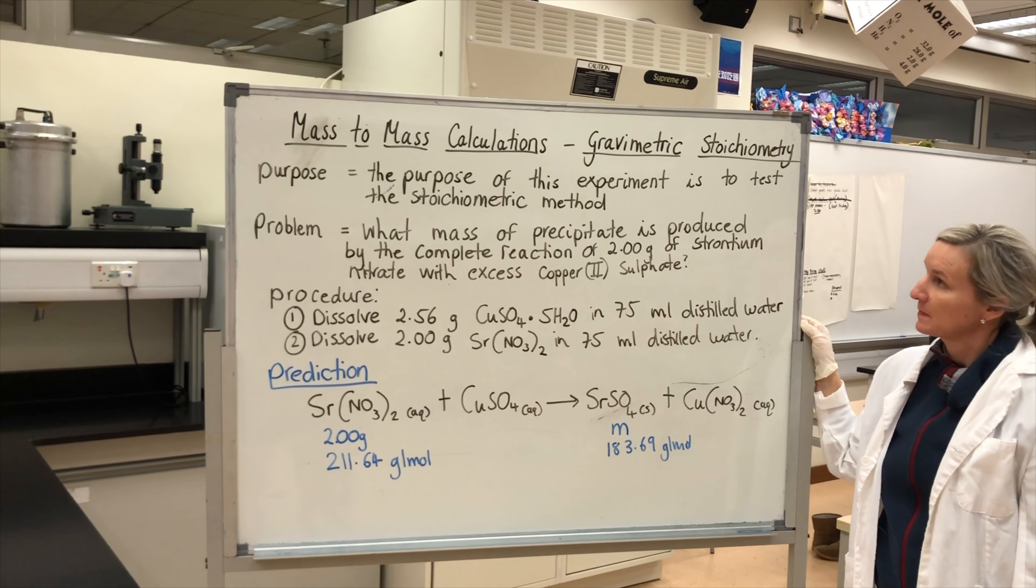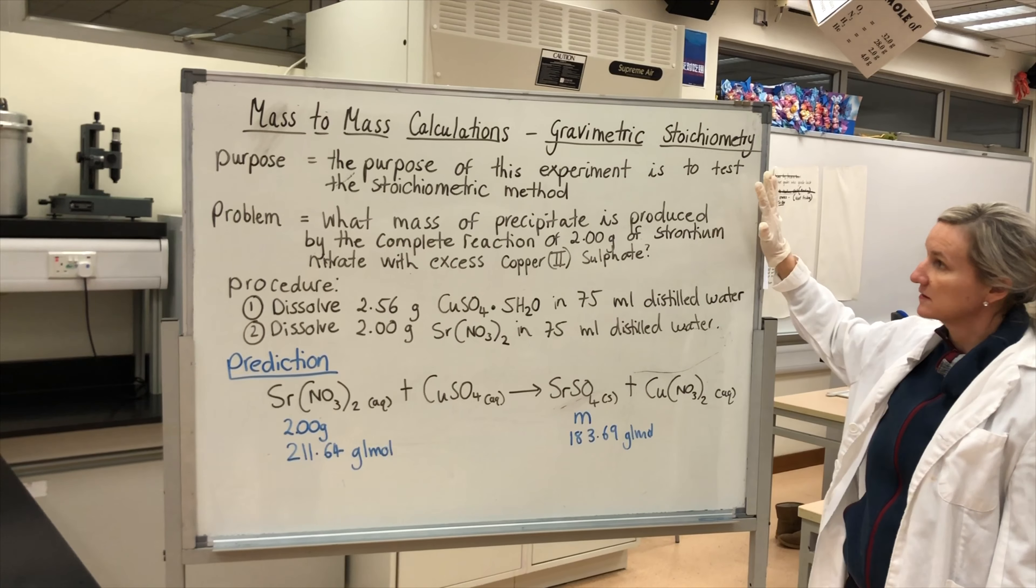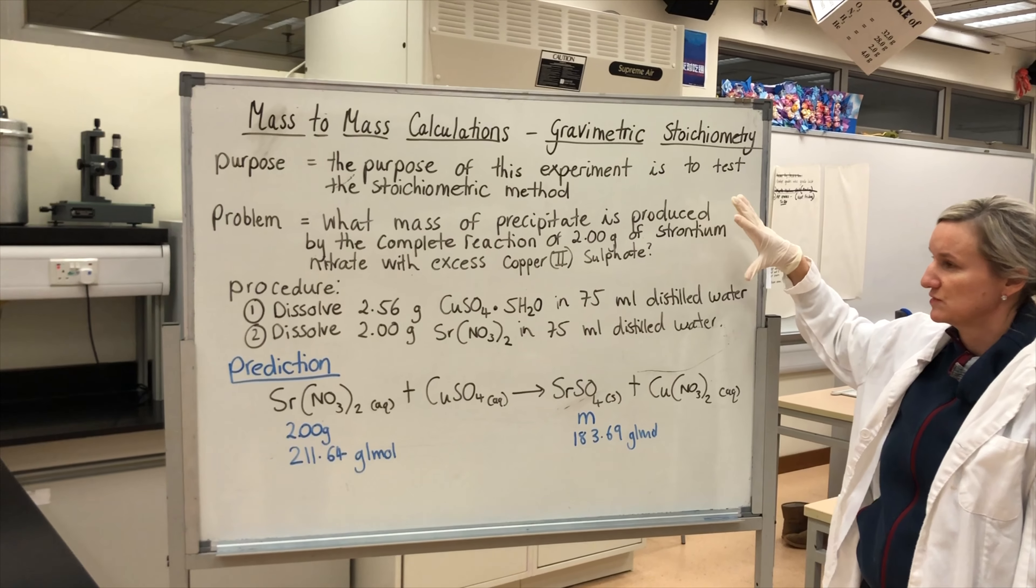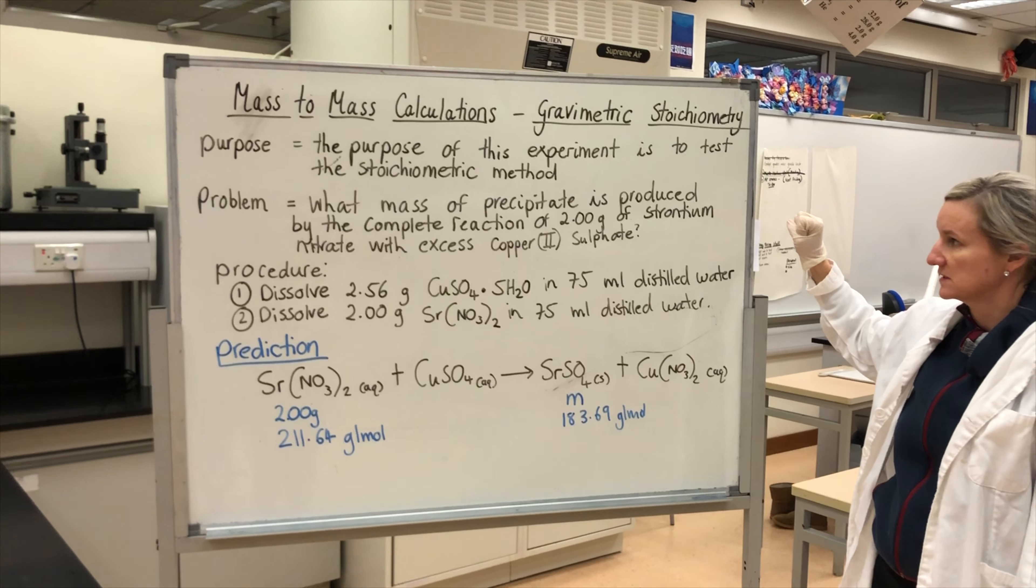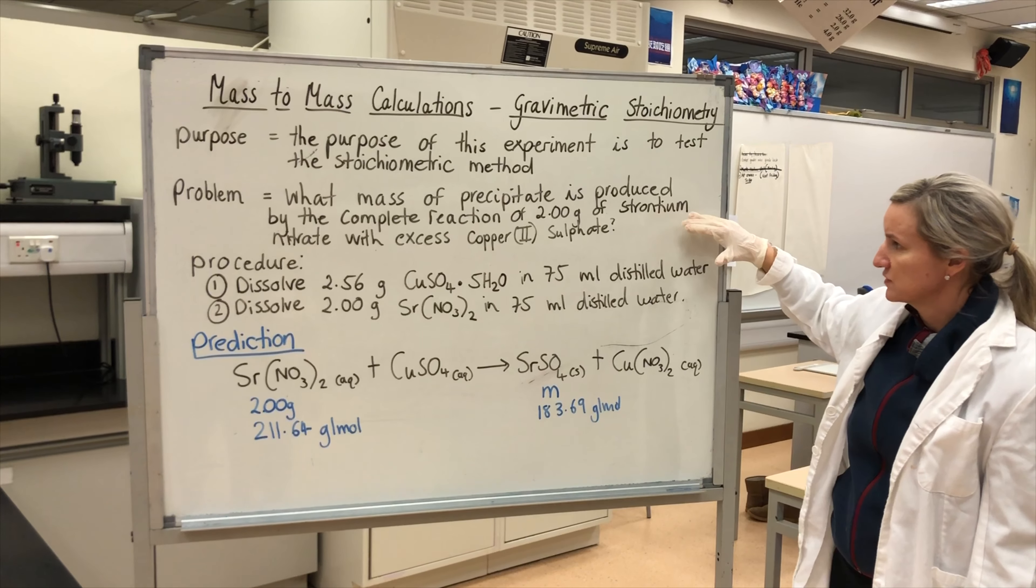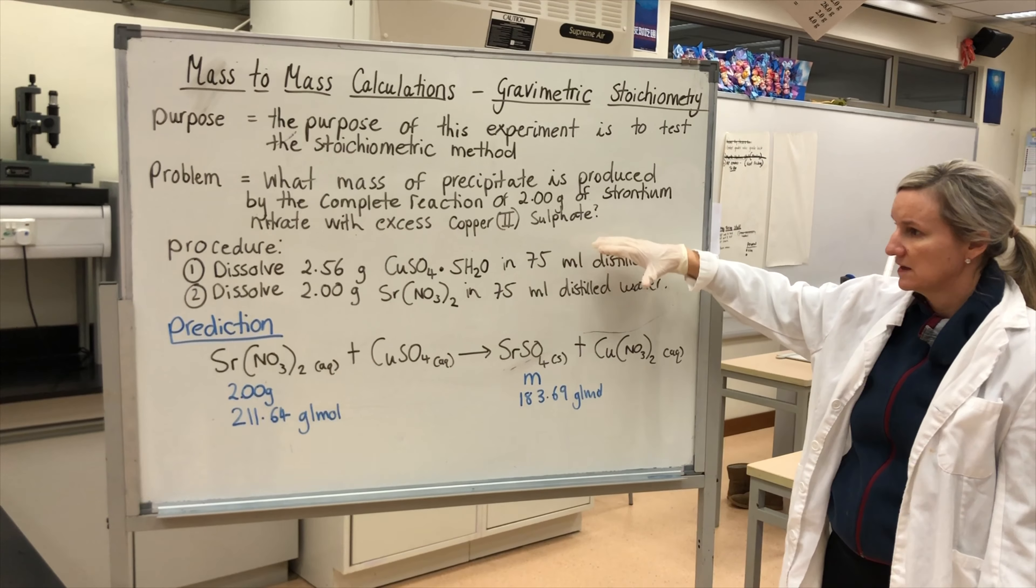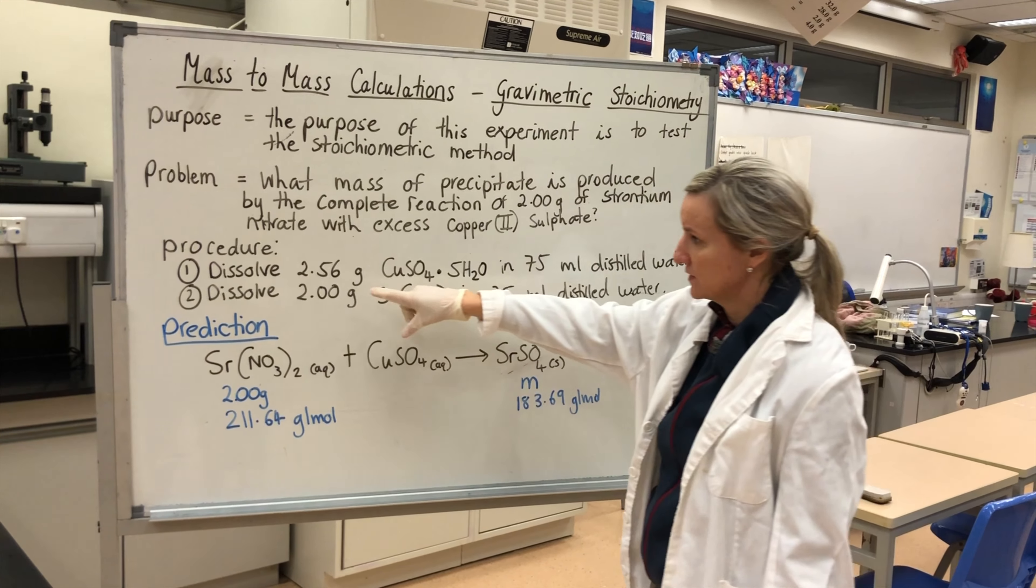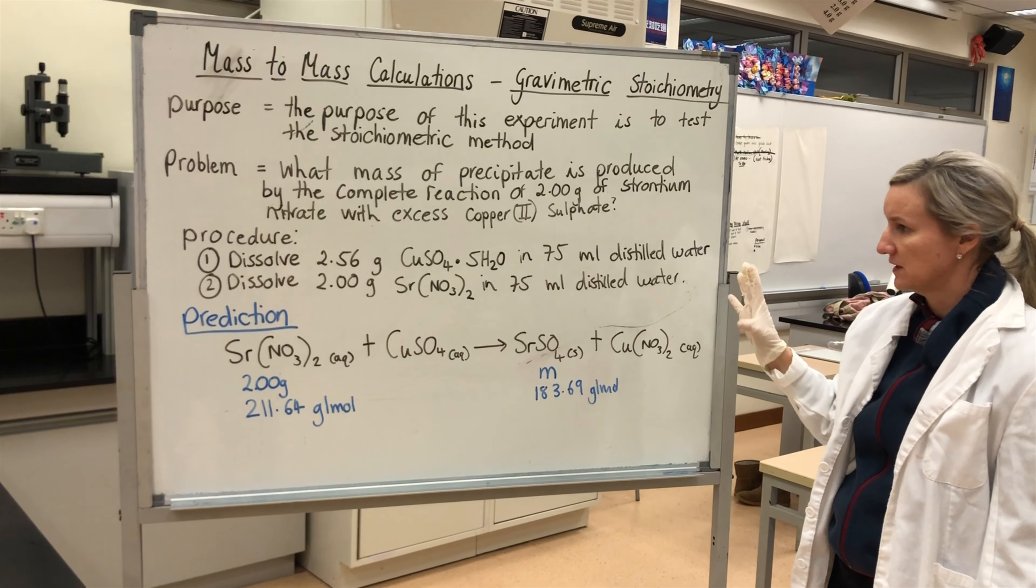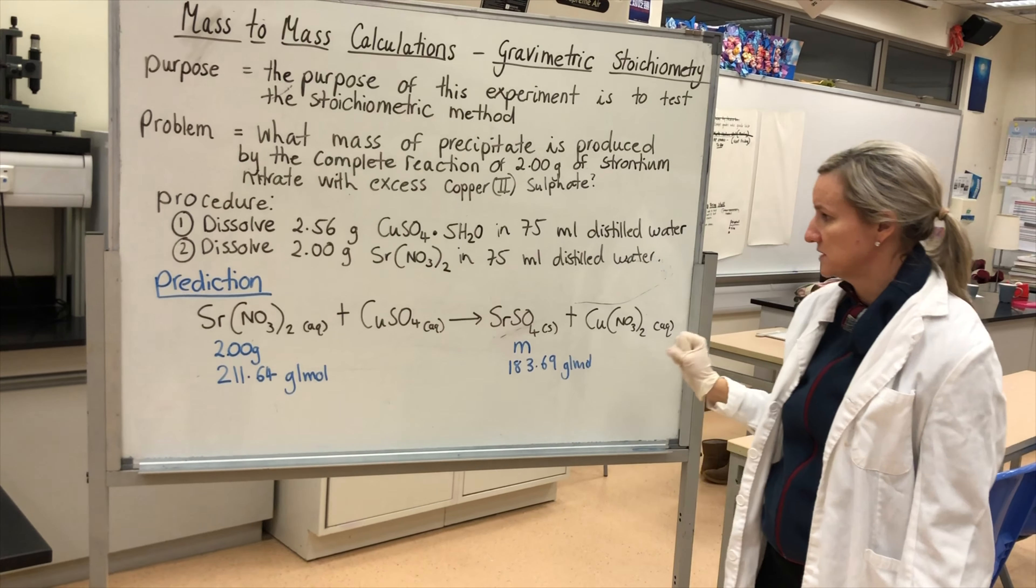So what I'm actually going to do is I'm going to mix some strontium nitrate, 2 grams of it, with some copper 2 sulfate. You can see down here that I'm going to weigh out 2.56 grams of copper sulfate pentahydrate and 2.00 grams of strontium nitrate.